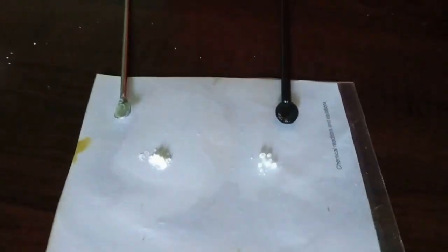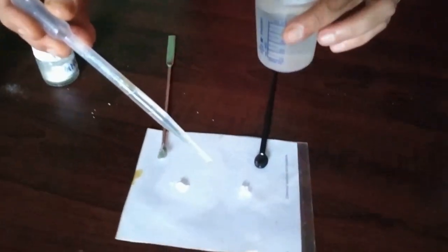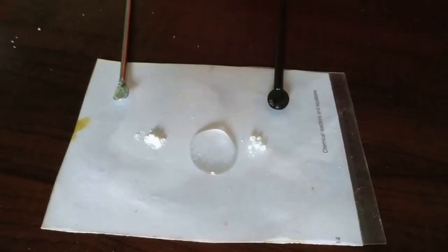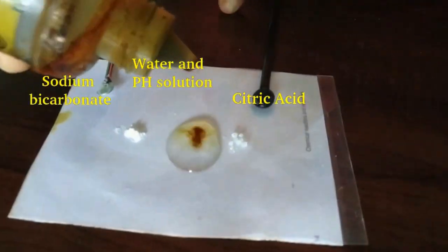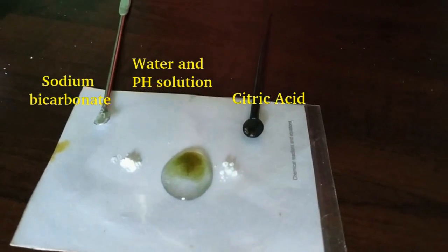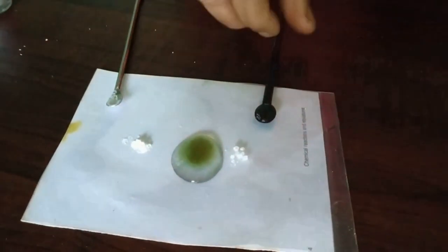Then we will have to take water in this dropper. If you do not have dropper, you can even use spoon. So put water in the middle. Now we shall take pH solution, pH indicator. You can take any indicator, even phenolphthalein or natural indicator that you are preparing, anything you can take, but I am taking pH indicator. Now you can see the color green because water is neutral.